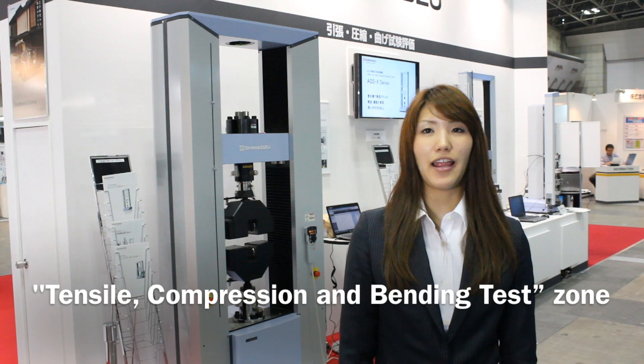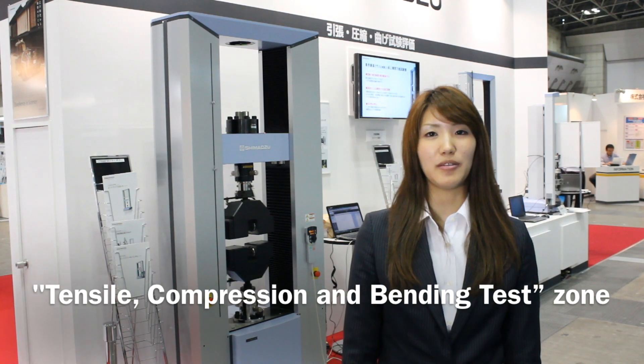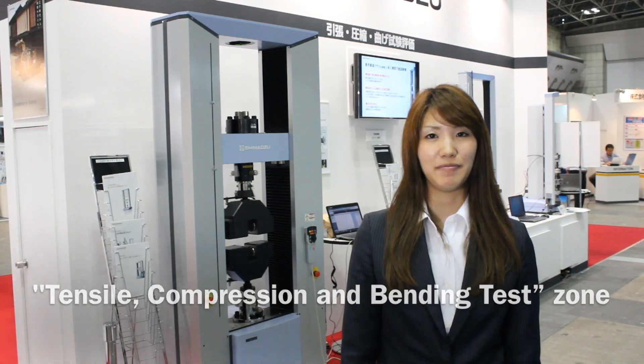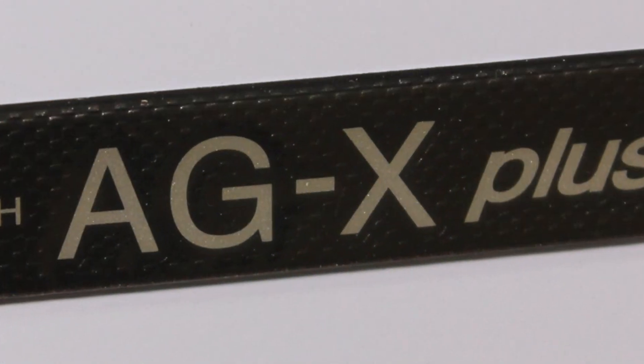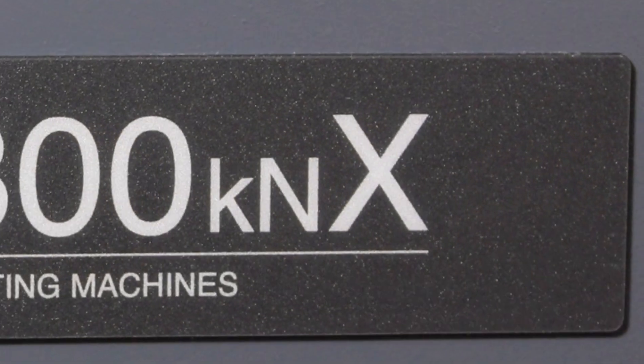This is the Tensile Compression and Bending Test shown at Shimadzu's booth at Test 2013. Shimadzu's X series is a high-precision universal testing machine lineup, which is a world leader in the testing machines industry.